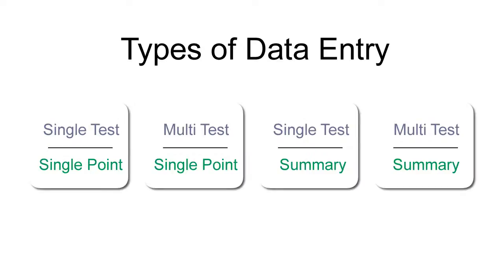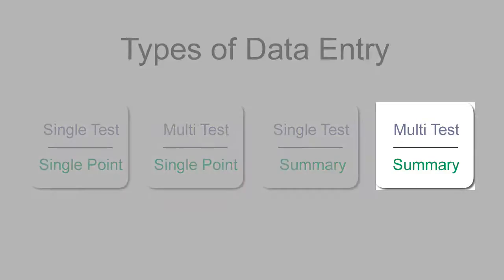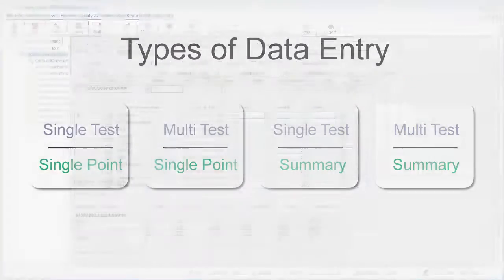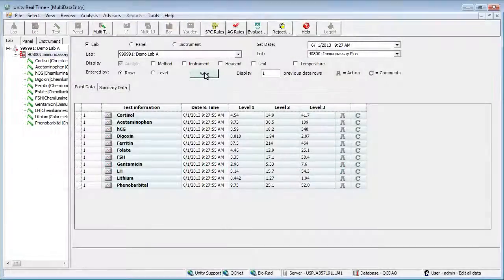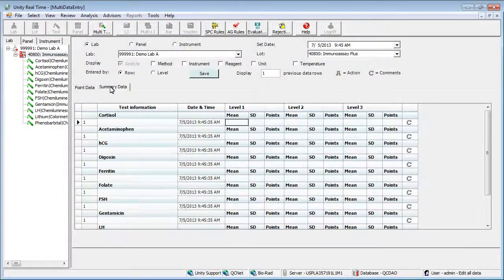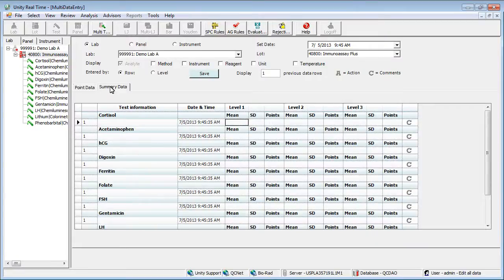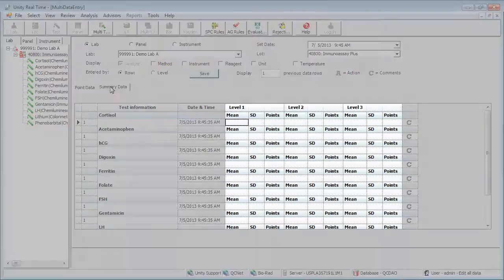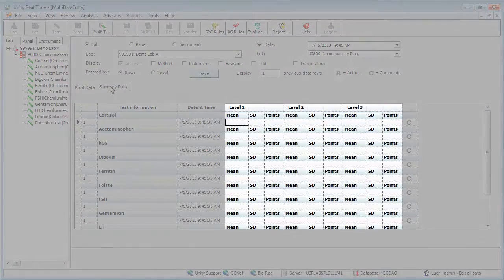Finally, let's take a look at entering summary data for multiple tests by returning to the screen where we left off. Click the summary data tab. The layout is similar to the last multi test approach. The difference is that here you enter the mean, SD, and number of points for each test.